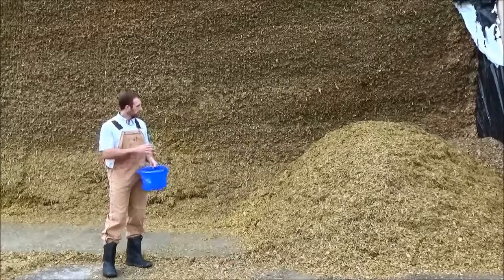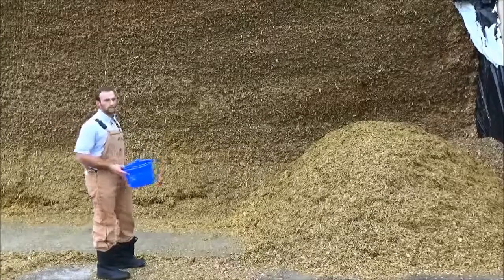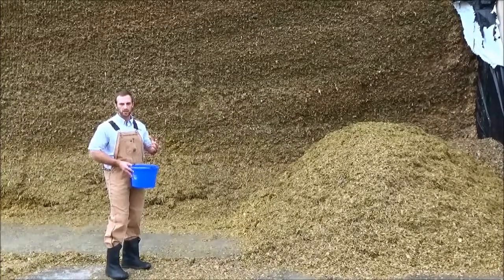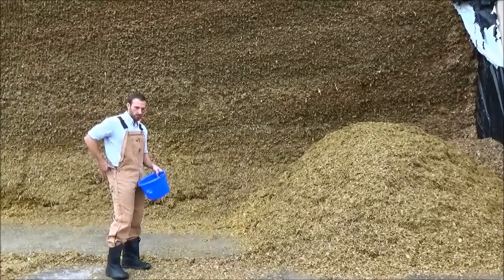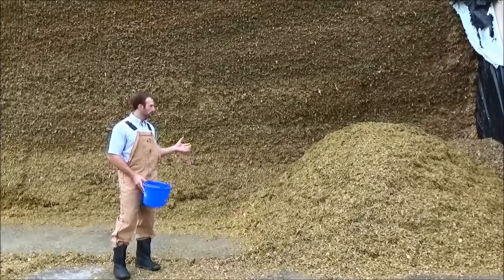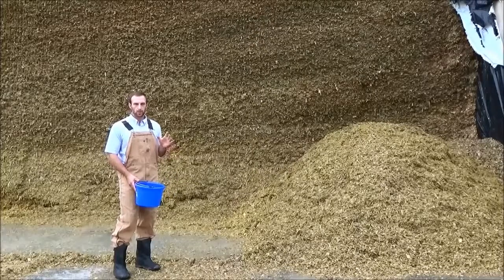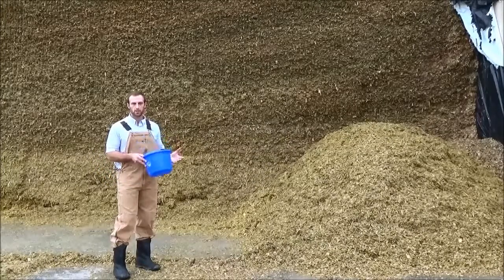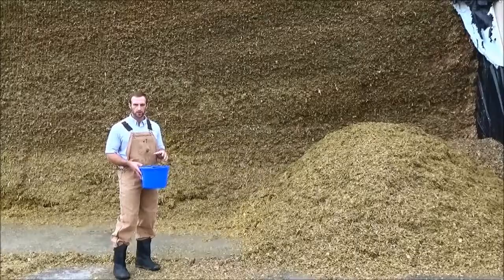In regards to sub-sampling — when we get in front of the silo, the aim is to accurately represent all the feed here. There are thousands and thousands of tons. How do we get that represented in a quart-size sample? All we need at the forage analysis laboratory is about a pound — 500 grams — which can be stored in quart bags. The second thumb rule is: take one sub-sample for about every 10 feet of width, with a minimum of five sub-samples, whether from an upright silo or a bag. Put those in your TMR mixer and make sure you get an accurate sample.